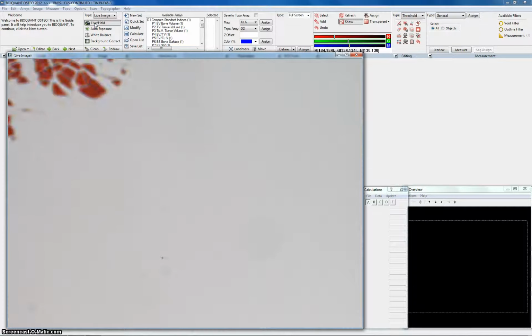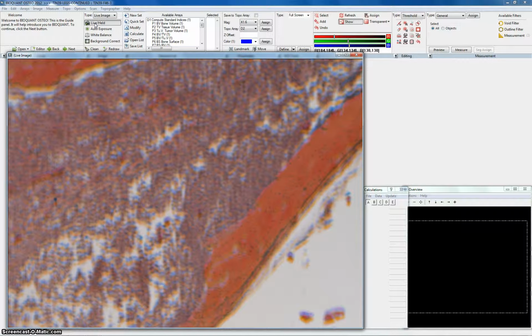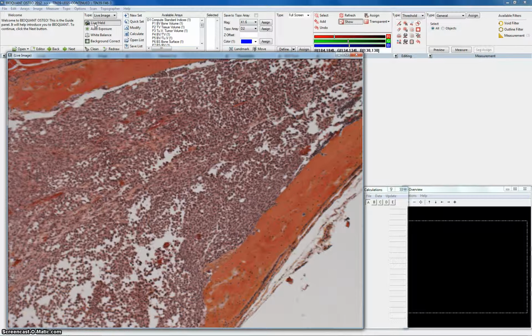It's kind of tricky how to adjust both at the same time, but okay, I'm here. Okay, and try to adjust the focus, or if you want, you can just turn on the autofocus. It gives me a hard time, so it's easier for me to just do it that way.